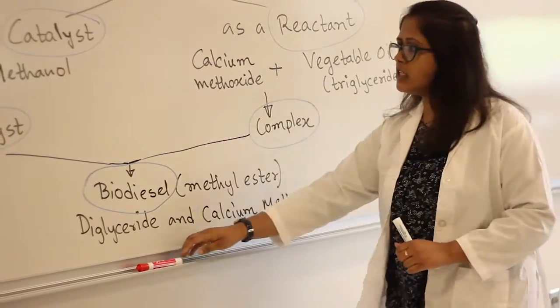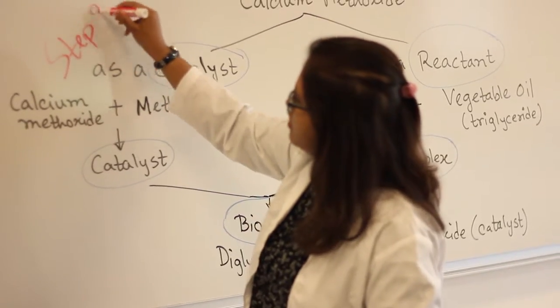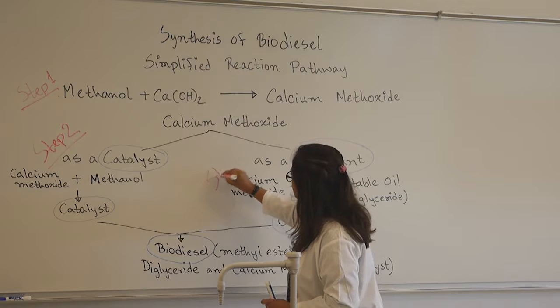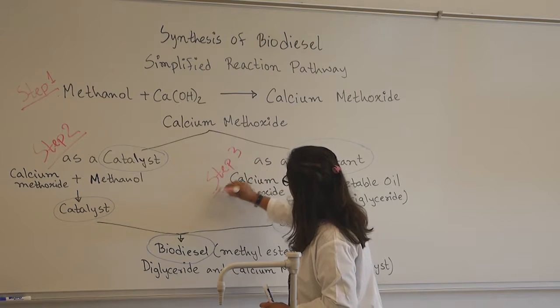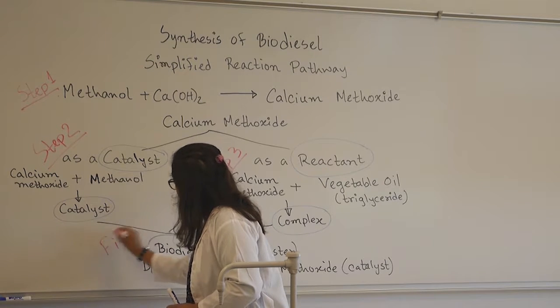So, this will be step 2, and this will be step 3, and this is the final product.